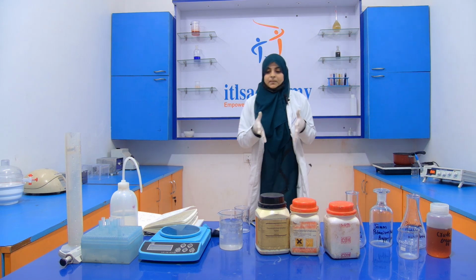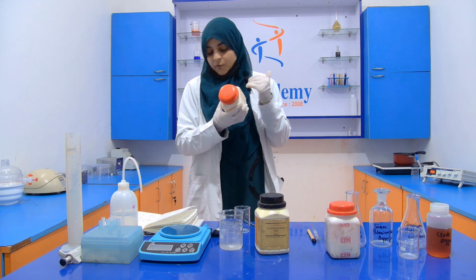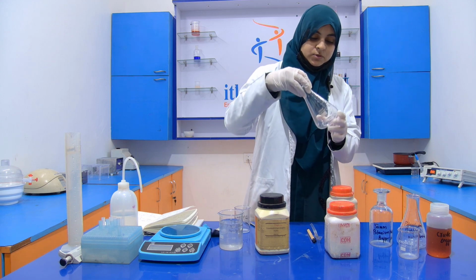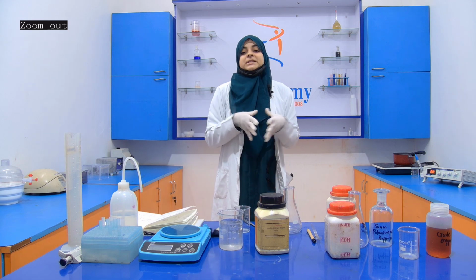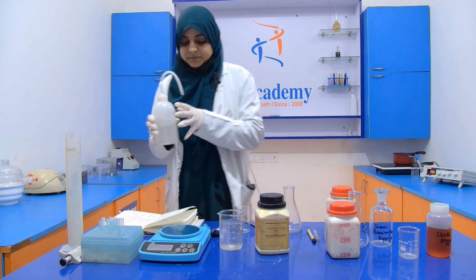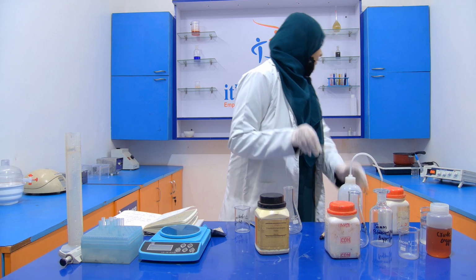So we prepare monobasic potassium phosphate. So this is your monobasic. For monobasic, what we have to do, first of all, we take 34.02 gram and dissolve it into 250 ml of distilled water. Now it is boiled.